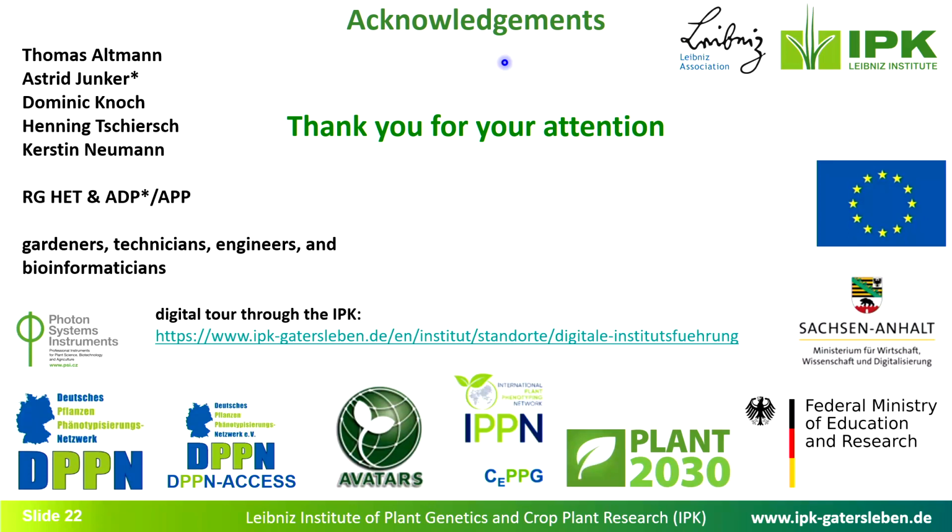I think with a combination of metal halide lamps and LEDs, we should be able to simulate also the frequency changes which we found in nature. So having basically a baseline light intensity supplied by the metal halide lamps, and then turning the LEDs on and off to simulate rapid cloud movement, for example. That should be no problem. If you just measure on a field and you can see there's a cloud coming, light intensity can drop by up to 1,000 micromole or more even now. And that is something which we should be able to simulate.